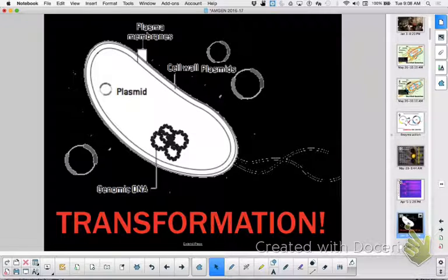and let it grow overnight in the incubator. Yeah? Since it's like so small, the bacteria and the genes we're putting in, how does the bacteria know to take it? It doesn't know. We're going to create a pressure differential having to do with temperatures, and that's a real specific thing where it's got to be at this many degrees for this many seconds, and you pull it out and put it back on ice, and then you do this, so it's really specific, so you don't screw up on those days. Yeah. When you're God, you have to be really good about things.